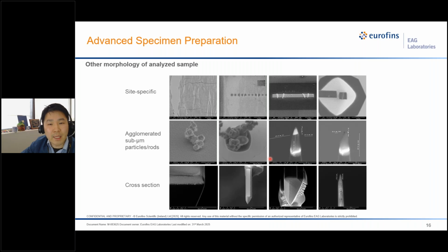We are also capable of doing advanced sample preparation like targeting grain boundaries, and we can do direct lift-out for powder specimens. We also can do different orientations like cross section or backside, which are usually needed for device samples, by reorienting the structure relative to the direction of evaporation.